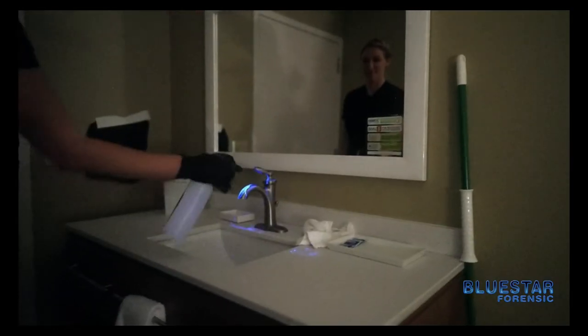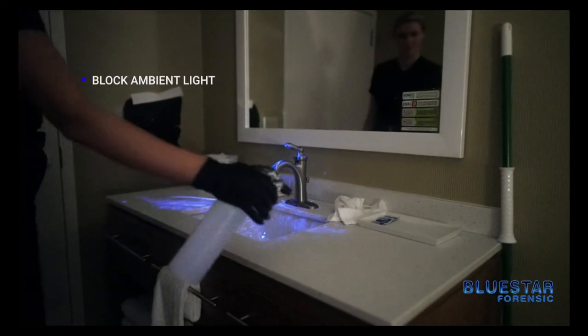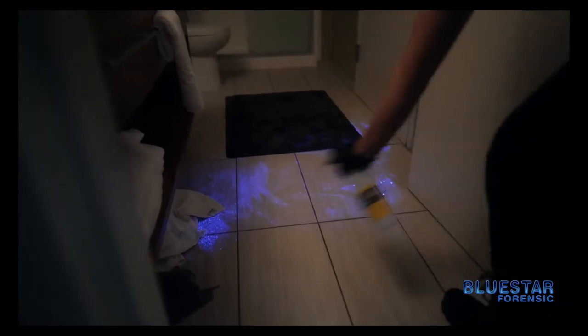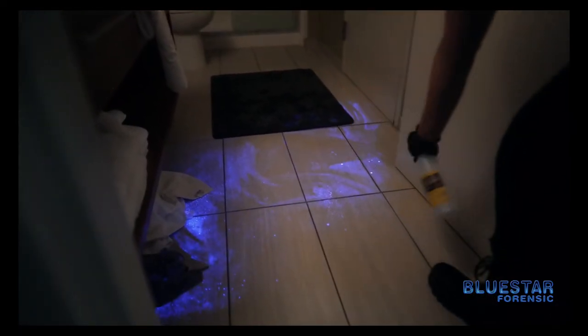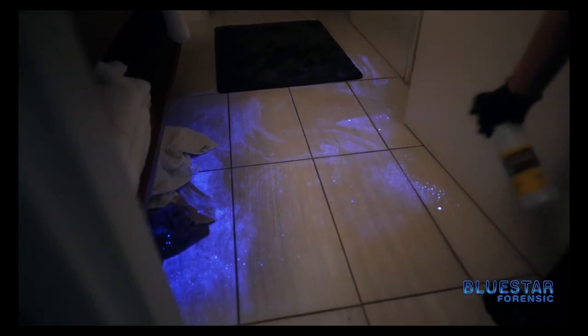Additionally when you're trying to photograph, you want to block any unnecessary ambient light that could impede your photograph. When you're using Blue Star, remember everything you're documenting at this point is evidence. So again you want to make sure that you do this properly.